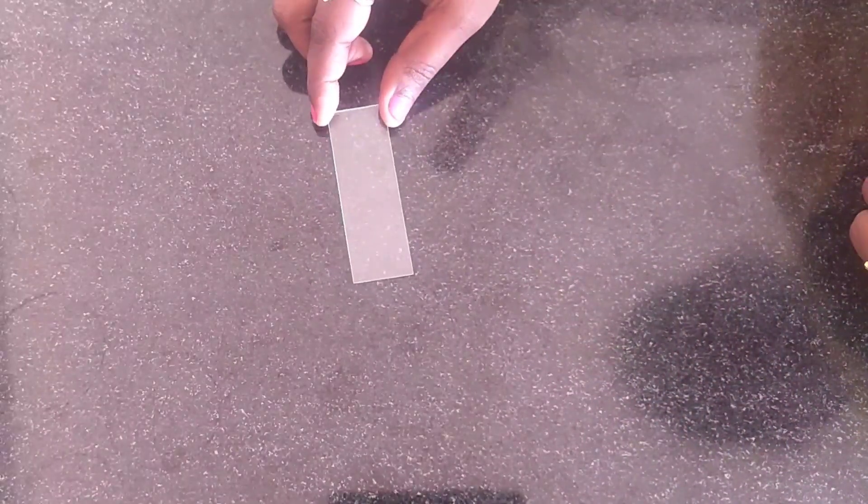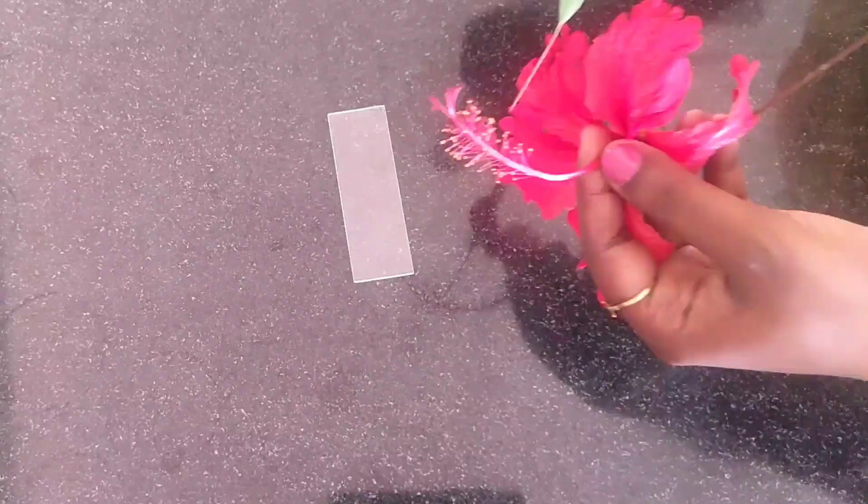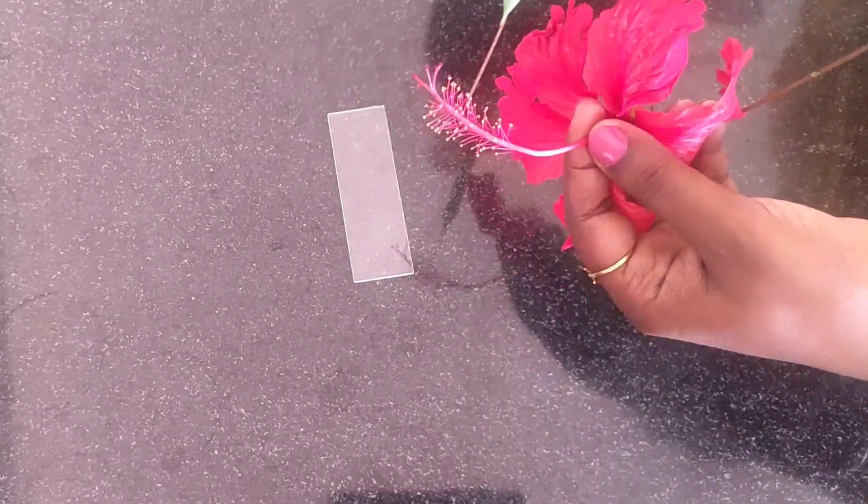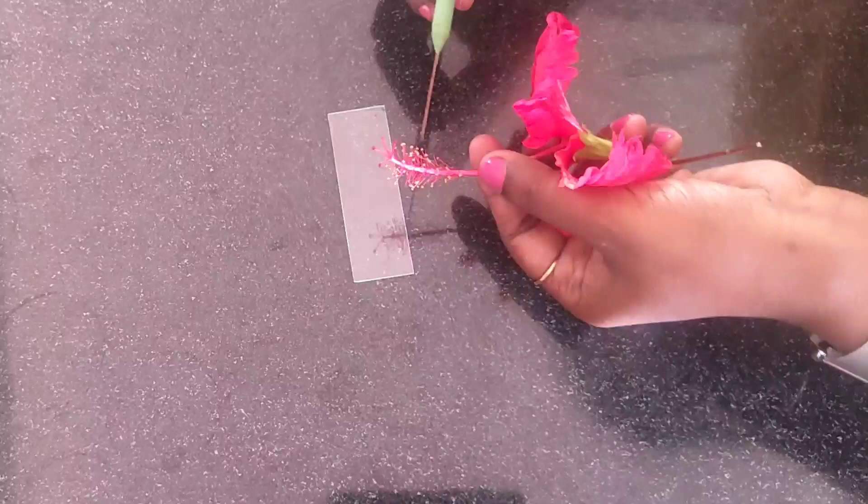Now let us see the procedure. We need to take a clean slide. Now we have to dust the pollen grains. Here on the tip of this yellow color region you can find the pollen grains. Now we need to dust these pollen grains onto the slide.